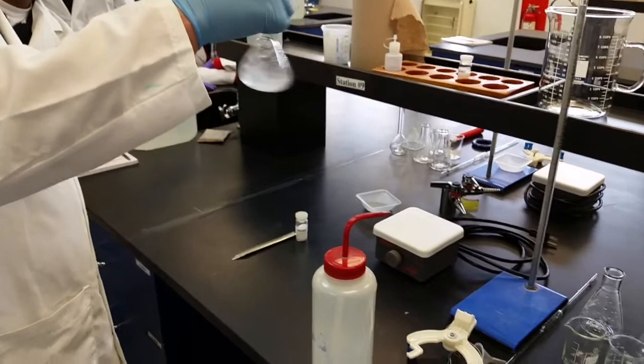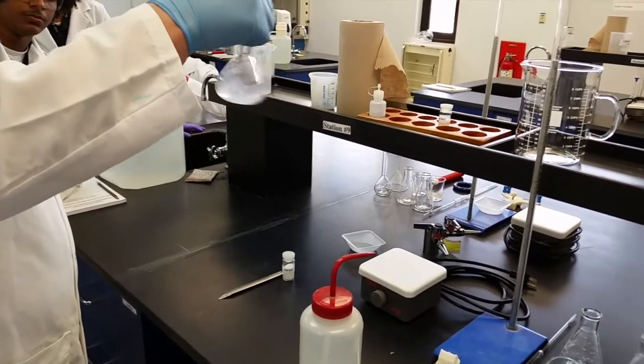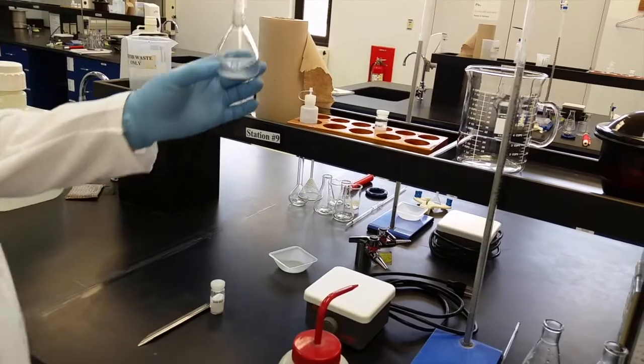You wash the funnel, making sure no solid is stuck to the walls. And then you try to dissolve your acid salt. If you see that you need more water, you will add more water.